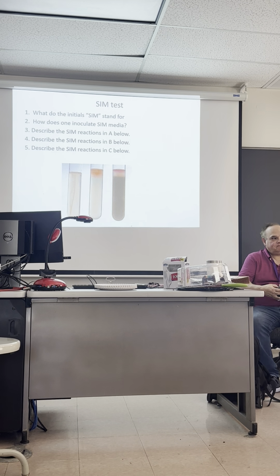You'd say ferrous ammonium sulfate or iron. I would rather you just say iron, it's easier to remember. And that's the presence absence indicator. There's only two presence absence indicators. There's one for hydrogen sulfide, ferrous ammonium sulfate, iron, and then there's methyl green for the DNAs.